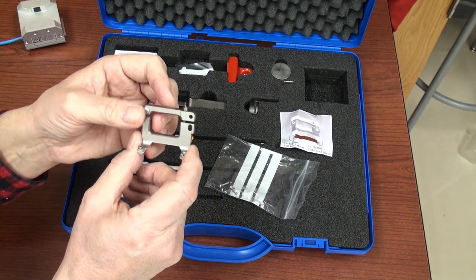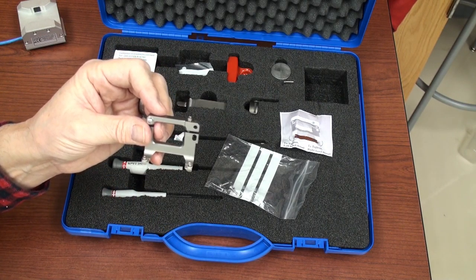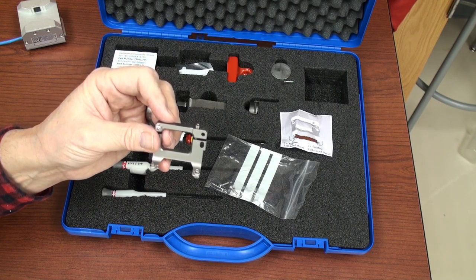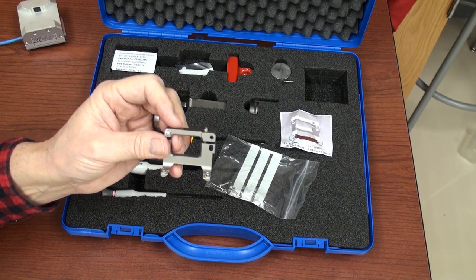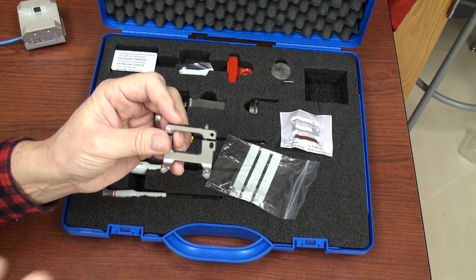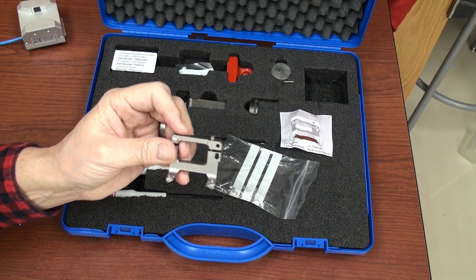Another important feature: once the knife holder is mounted, the blade angle is fixed at the optimum cutting angle. I've been using tissue slicers since 1979 and I almost never changed the cutting angle. The 7000 SMZ2 is my personal favorite tissue slicer — this is all optimized to give you the best slices of tissue, well beyond any other system I've used, including competitive systems.